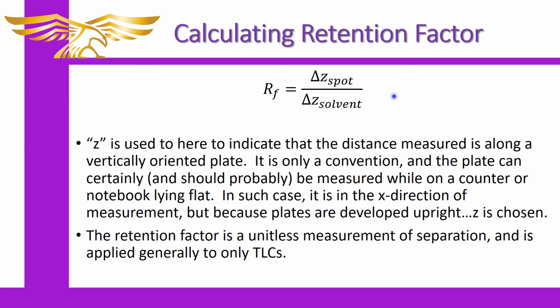And you'll never have a plate that goes over like 70 millimeters or anything like that. So that's predominantly what to keep in mind with these measurements, is just make sure that you're being reasonable about the level of precision and accuracy that you can have, and be sure that you're calculating it correctly.